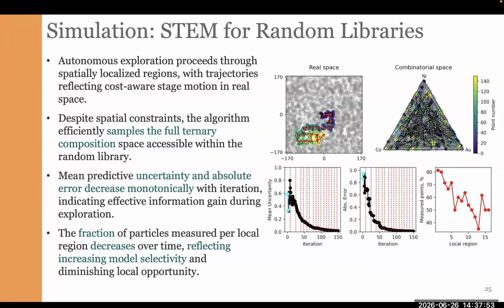What is interesting? If we use the definition of the problem as we discussed, you may observe several interesting consequences. The first, obviously, when we decide to move our stage, to change our field of view, our model will choose mostly the most neighboring region. It's just a consequence of the uniform distribution and the constant density.